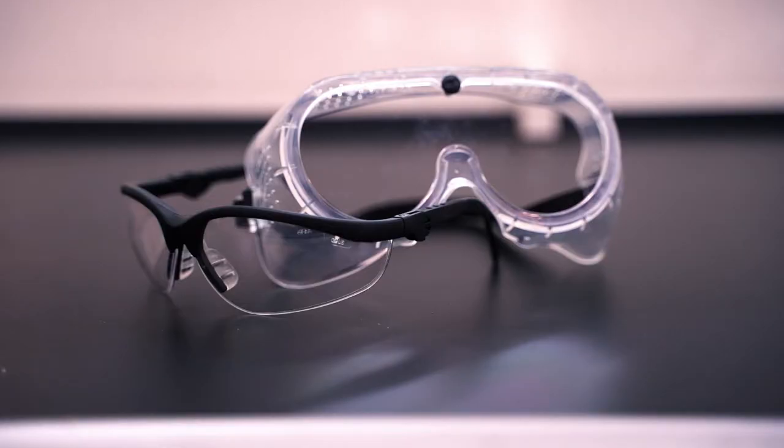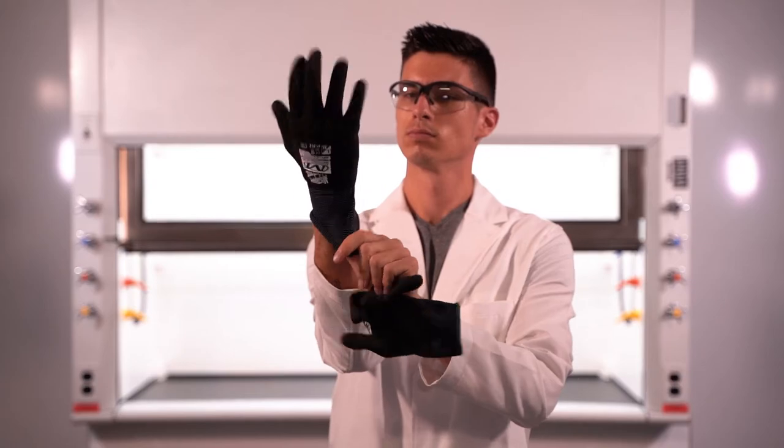And lastly, always be geared up, including safety glasses, lab coat, and possibly gloves should there be an accident, explosion, or spill.